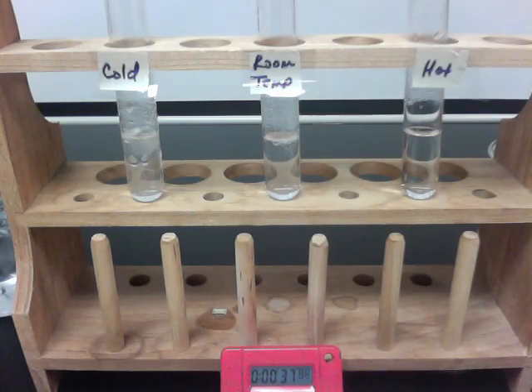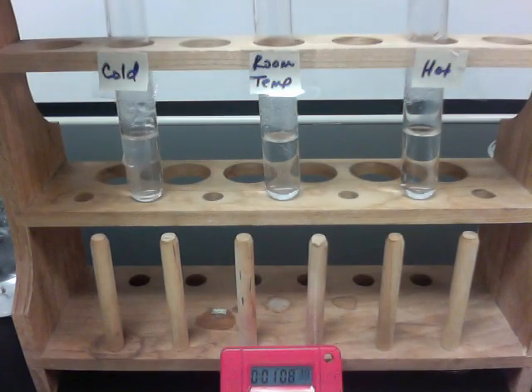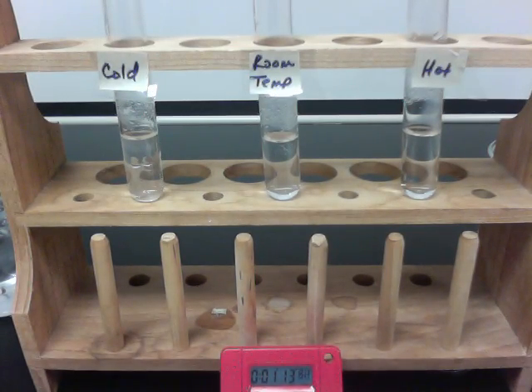It's about 36 seconds. The room temperature was done at about 42 seconds. And the cold one is still going. We'll see how long it takes. Okay, looks like the cold test tube is done. Test tube 1 is done, and it was at about 1 minute and 12 seconds.